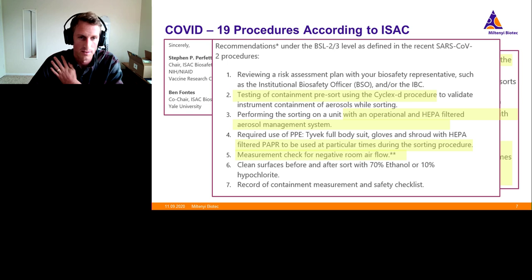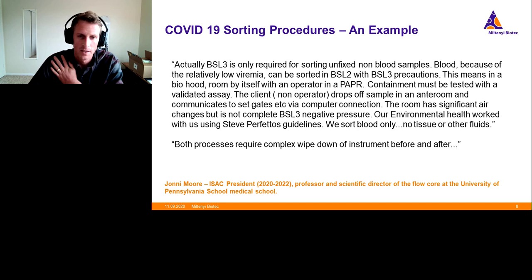I hope this is becoming more clear that it's not a trivial setup to get these things moving. This is from the ISAC president and from the University of Pennsylvania Medical School. Much of this is deliberately set up such that you have minimal operators working in the actual room.